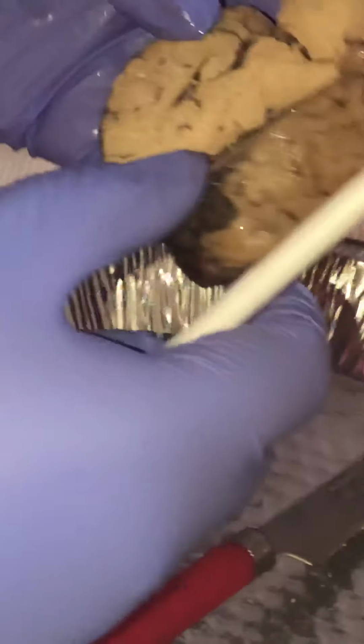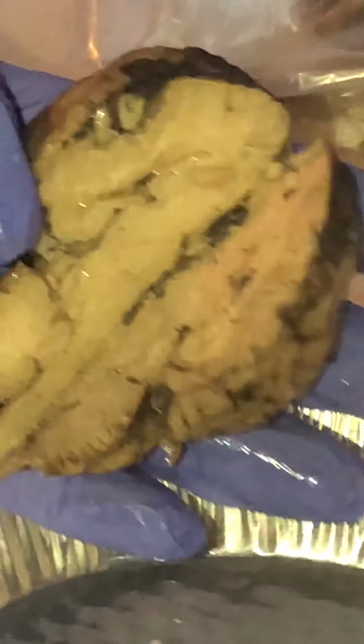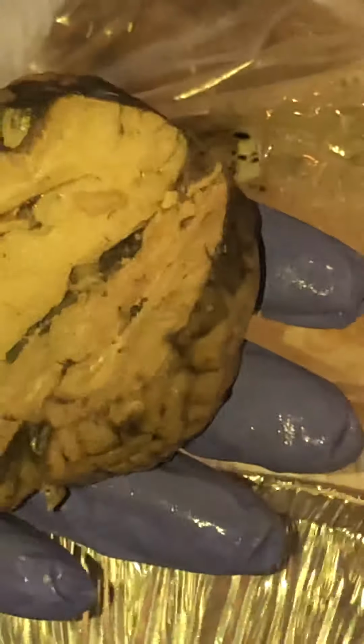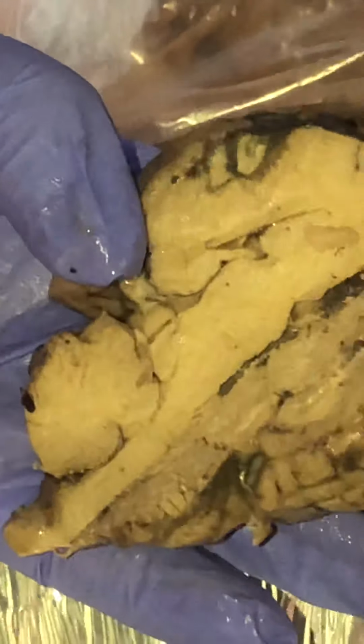Then we have the cerebrum. So the cerebrum is this right here, this whole area right here. The function of the cerebrum is to, hold on, I'm thinking.